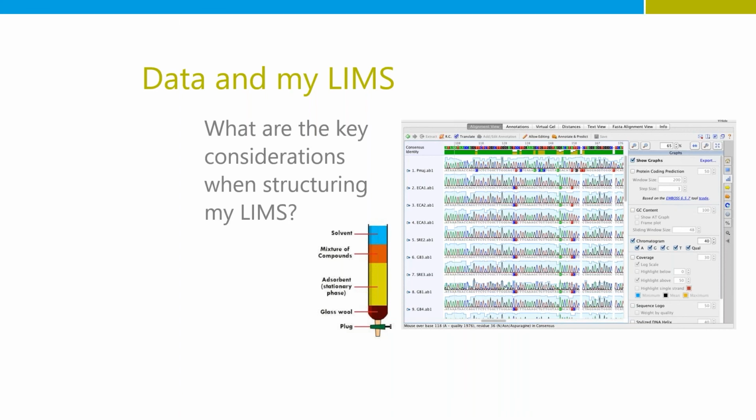Sure, Mark. And yeah, you're saying am I a detail guy on some of this? Yes, I am. When you're talking about a laboratory system, it's really key to select the right product and scale that right for your business and for your business growth and your expectations, because a lot of times a vendor will push their LIMS because you've bought their instrument. That's not always the best choice. Really, it's all about ROI, cost and accuracy, and what are your traceability requirements, and are you able to handle growth?